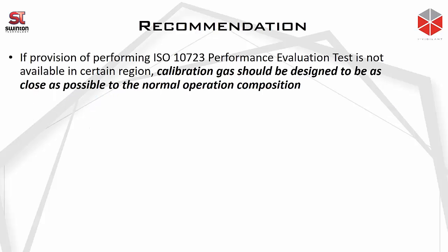So here are some of the recommendations that I have. I'm talking about the overall global market, rather than places that have ISO 10723 performance evaluation tests easily available. If the provision of performing ISO 10723 is not available in a certain region, what we need to do first is design the calibration gas to be as close as possible to the normal operation composition.